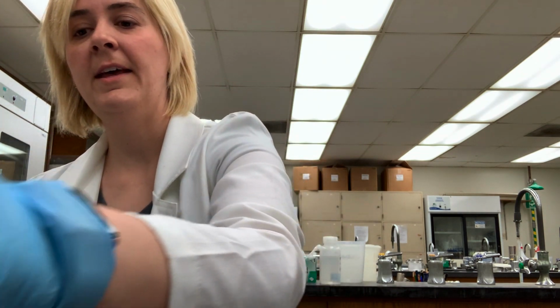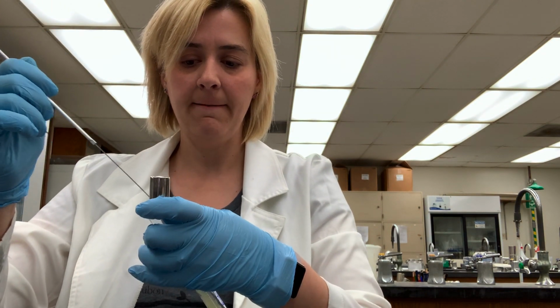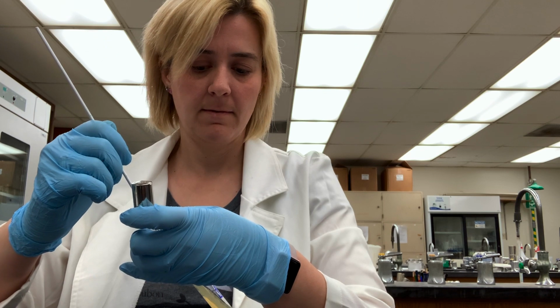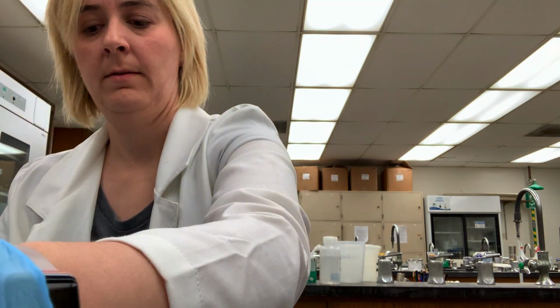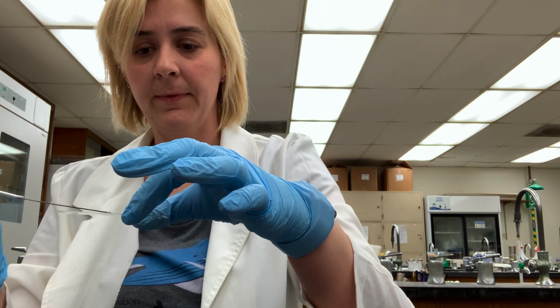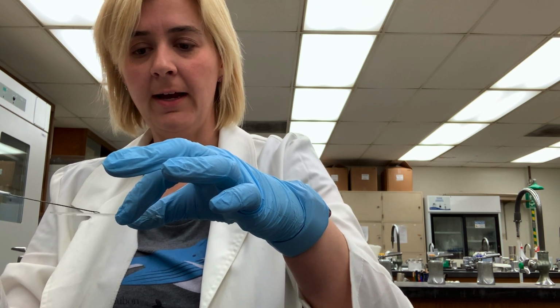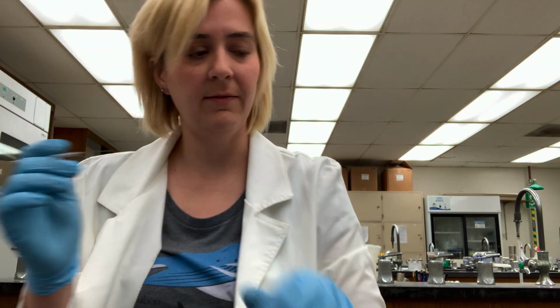Okay, and then I'm going to just take a little loop full of culture off the agar slant. And I'm going to mix that with the water I put on this slide here. So mix it, kind of spread it around. This one's probably going to take a little bit longer to air dry, so I'll cut and paste the video. And I'm going to stain that one with a different stain so we can see what a couple of different stains look like. So I'm re-sterilizing my loop.